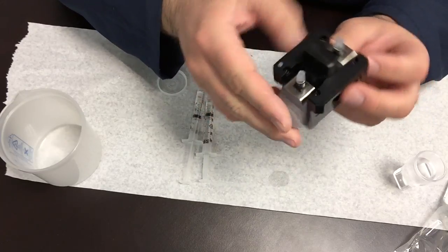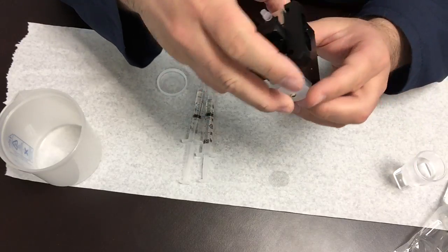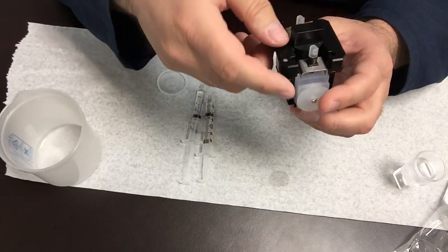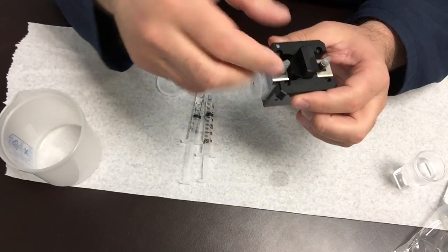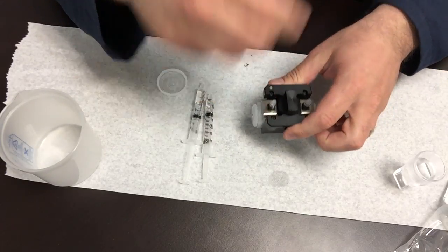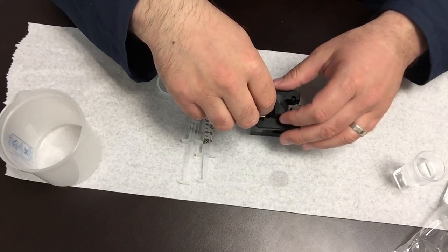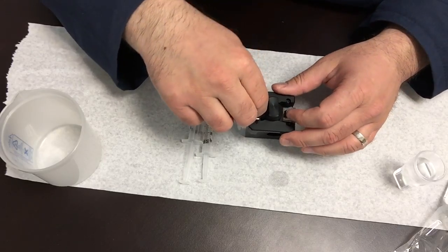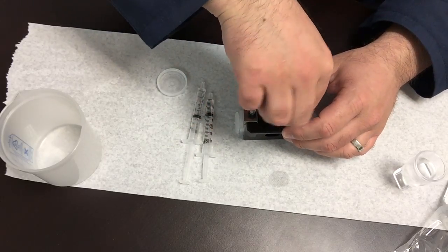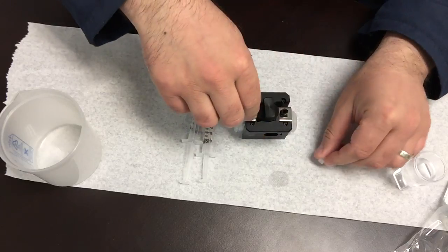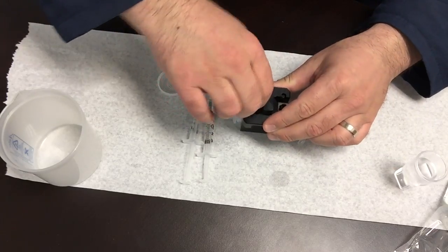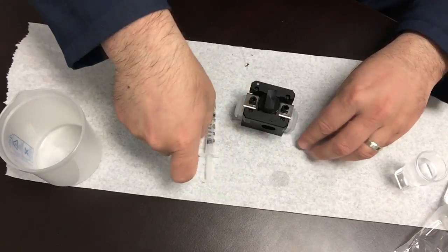And once you place into the instrument and perform the analysis and the analysis is complete, to remove the sample you want to be sure that you always remove the sample. You don't want to leave it sitting in the cell. It could dry up and crystallize and cause issues. So you just want to take the caps off, leave one cap out.